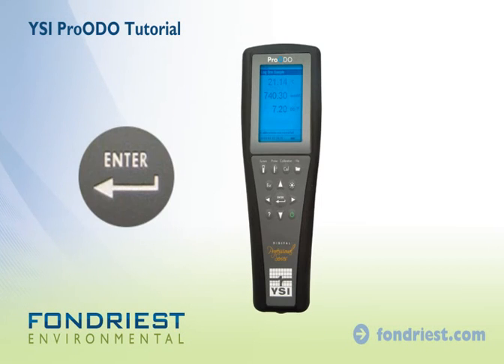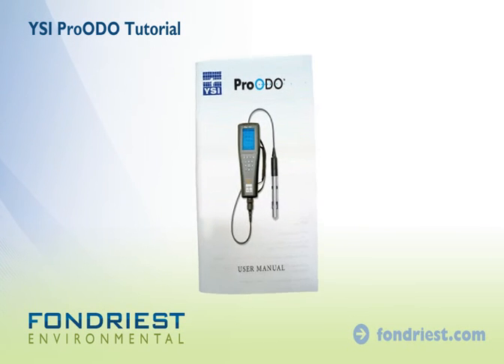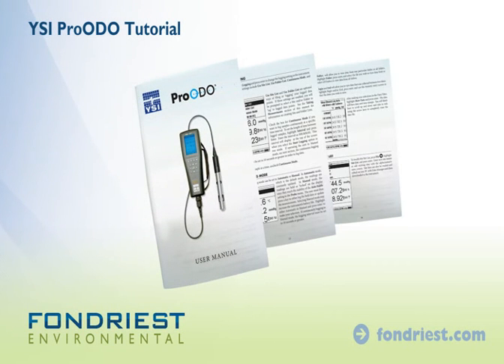Press enter to log the readings with a date and time stamp. Refer to the manual for setting up site lists and advanced logging options.